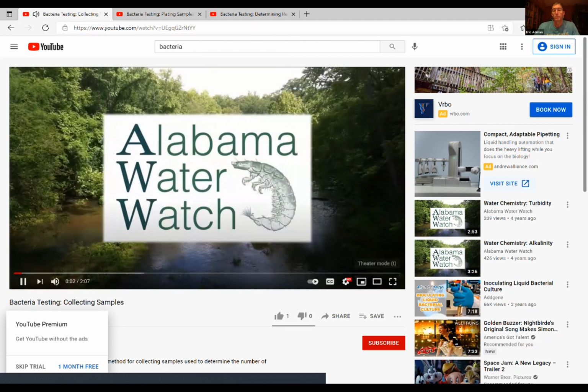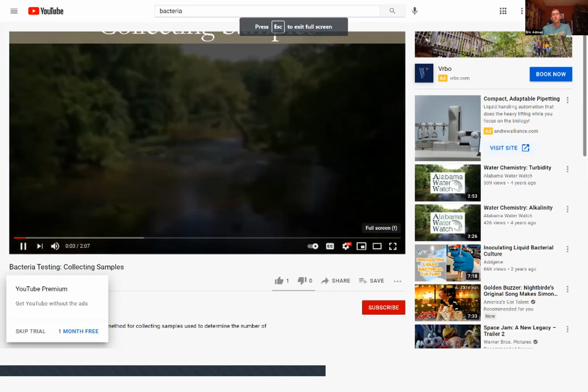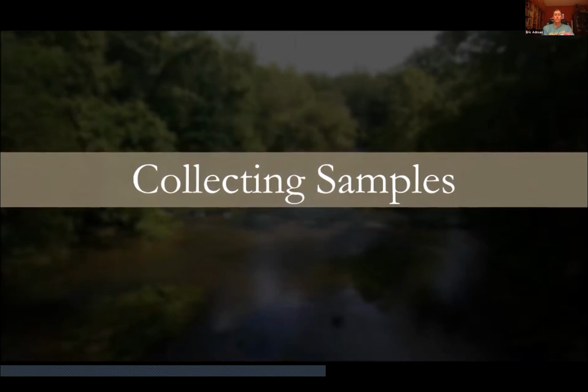Welcome to the Alabama Water Watch instructional video series. This video will show the proper method for collecting water samples used to determine the number of bacteria in the water body. This is the first step in a 3-step process. The second and third steps, plating the samples and determining results, are covered in their own separate videos.